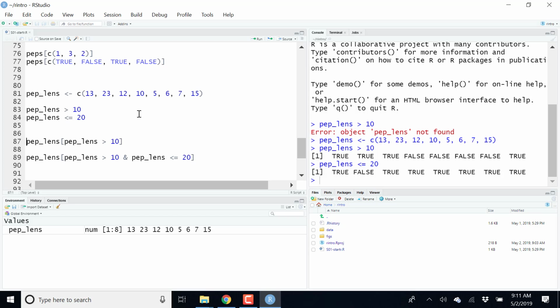Okay, so these are concepts that we're going to review today, but not on vectors, on kind of bigger data structures that are probably much closer to the kind of data that you would analyze if you have, for example, quantitative proteomics data. Yes?